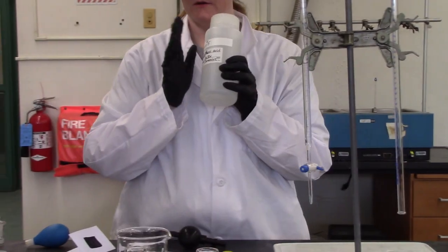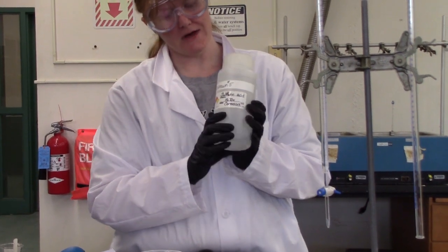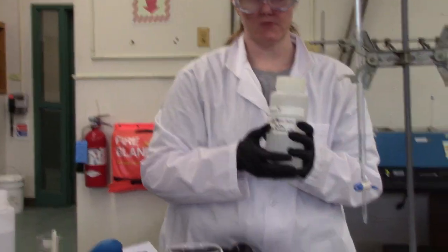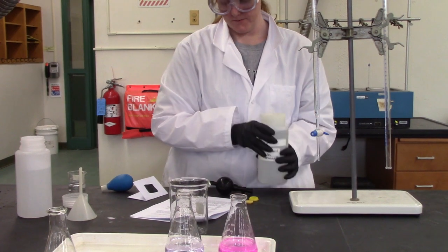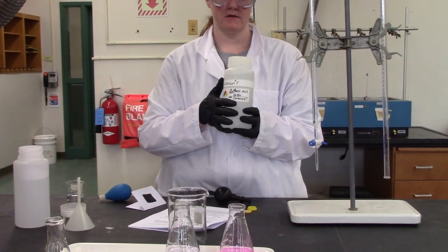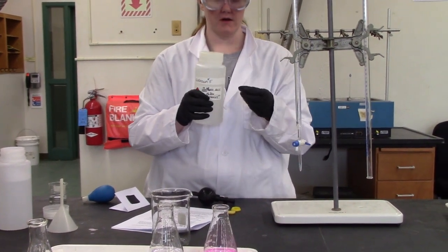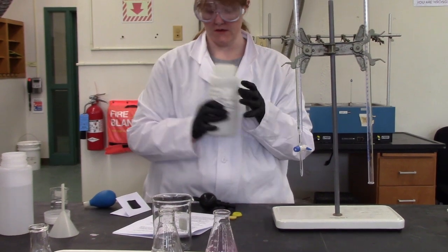You're gonna put your, oh no, I got acid on my face. I'll wash that. You're going to put your acid into your flask and do the same exact process that I just showed you. The only thing that's different is instead of using 20 milliliters of this, you're going to use 10. So you're going to use a smaller pipette. Be sure to pour this into a beaker and pipette out of that, not out of the container here.